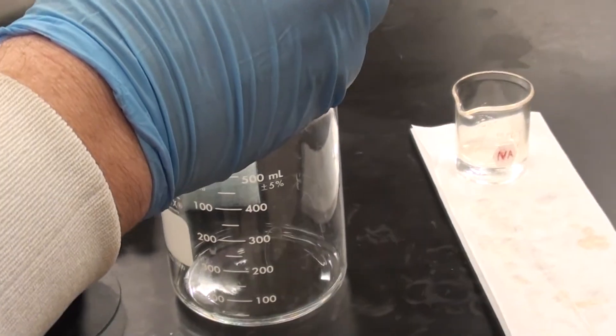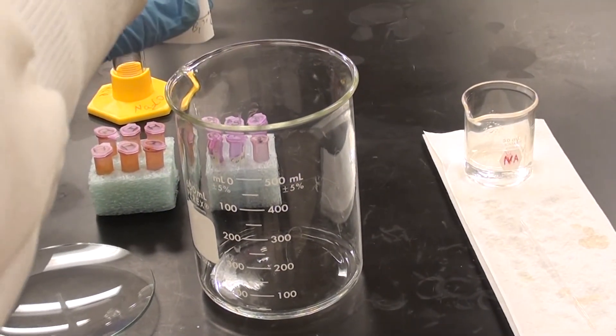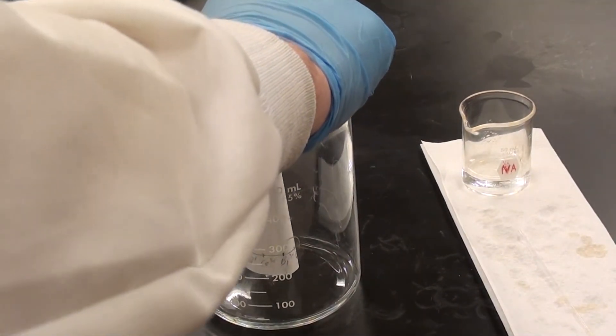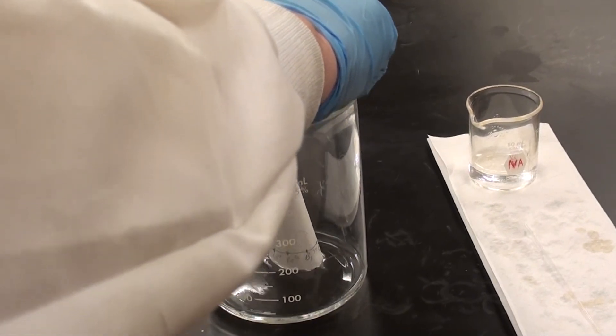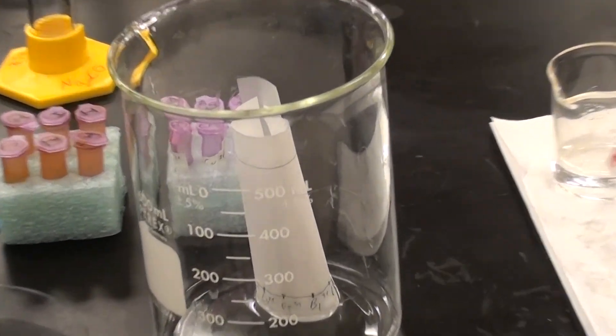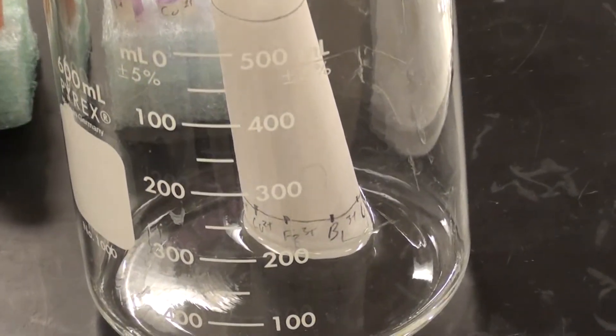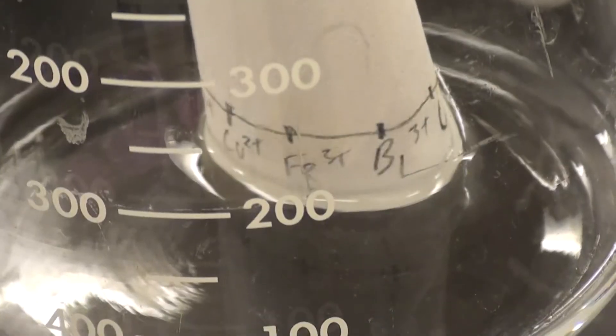And it's really important that once you've put it into the developing chamber, that you don't move it and you don't move the developing chamber. Now, as you can see, the level of the liquid in there is below the level of the line where the spots were placed.